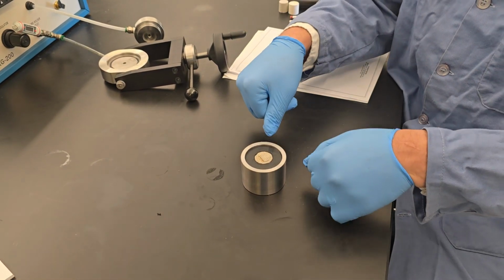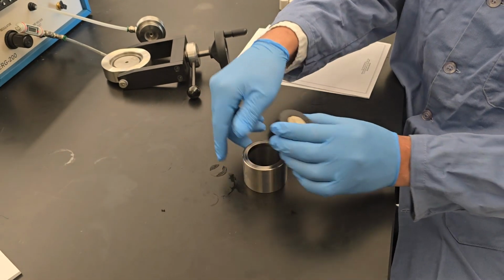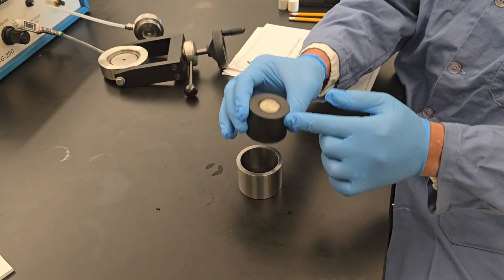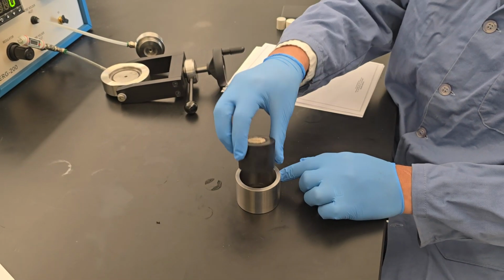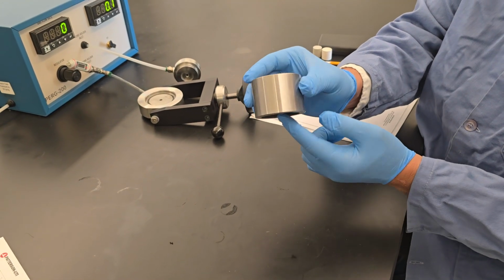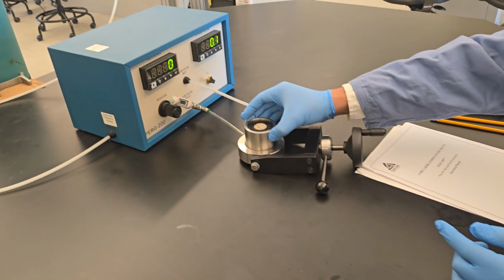So if you need to push, that means you put it in the wrong way. What that means is if I put this upside down, that will not go in, so I need to push. Or if I put it correctly here, and I put this upside down, also we need some push, so I'm doing it wrong. So make sure it slides in easily like this. Once it's slid in, we take the part. It does not necessarily have to come all the way here. That's good. Just take it, put it in the base here.